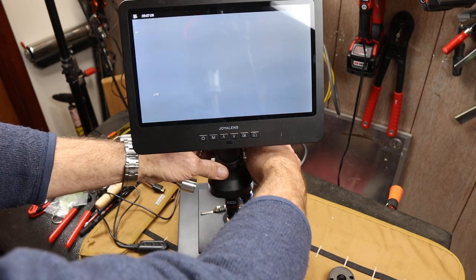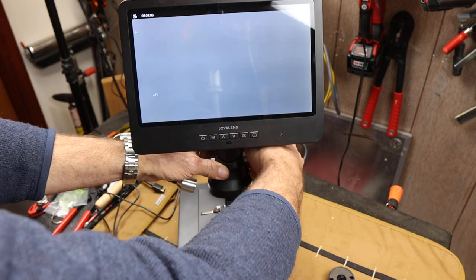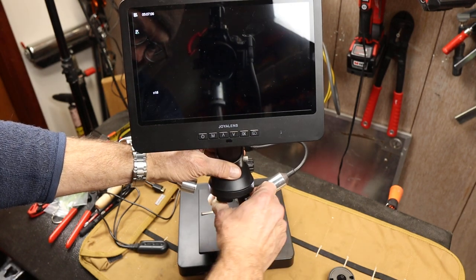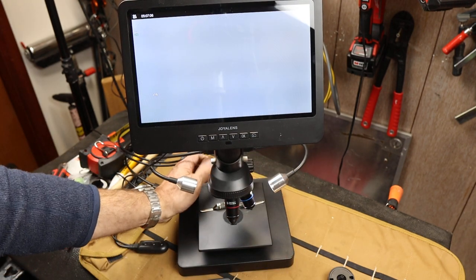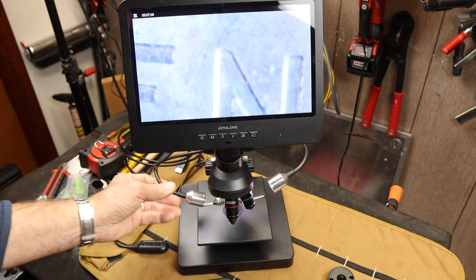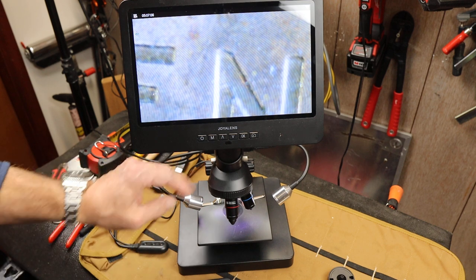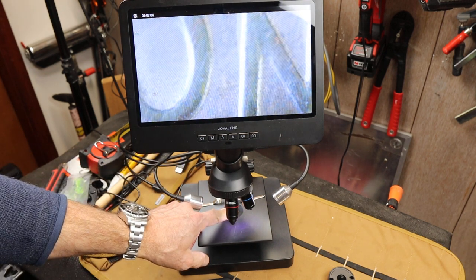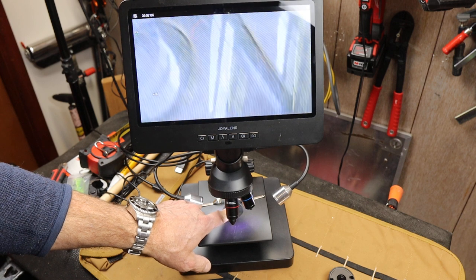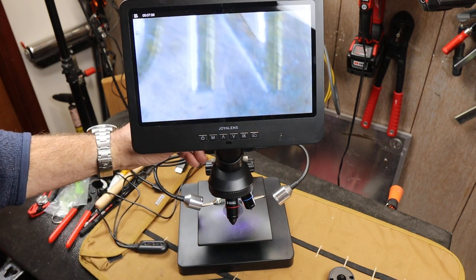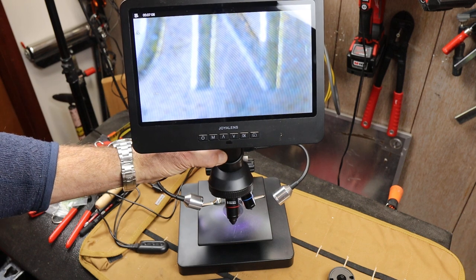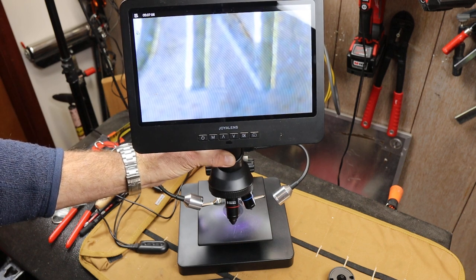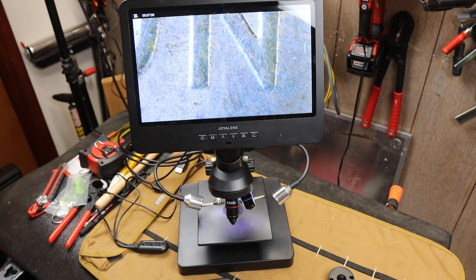So I'll throw in this other lens set, put it on a low power maybe, right there, so you can see. Now if I try to do, I've got two USB lights here basically too, so you can't see there's an objective in the way. But you can see I am using basically a compound microscope objective, right there, to just get a razor sharp, just tack sharp image.